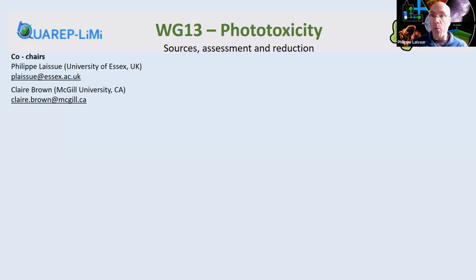Hello there. So we are working group 13. We focus on phototoxicity in the context of live fluorescence microscopy. This is chaired by Claire Brown from McGill University and myself, Philippe Laissue from the University of Essex in the UK. And we look in this group at the sources of phototoxicity, how to assess it, and what we can do to reduce it.